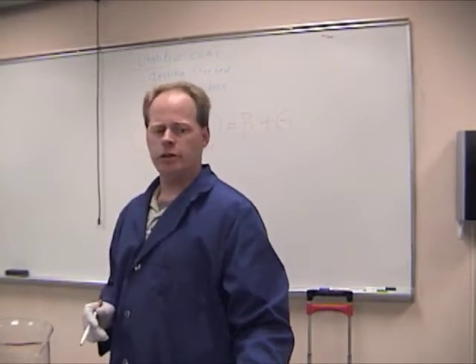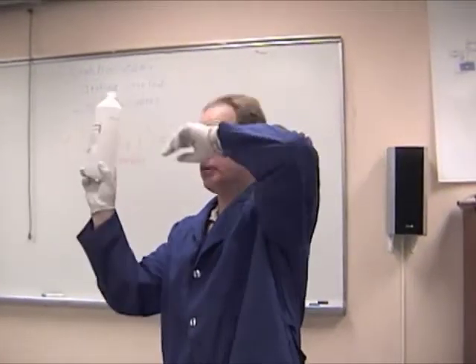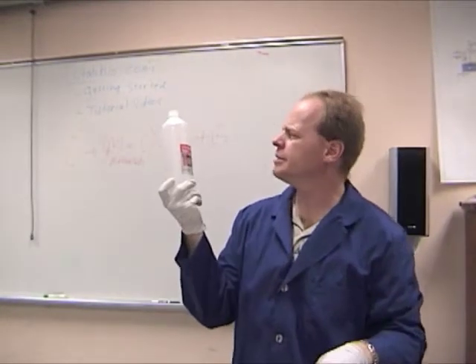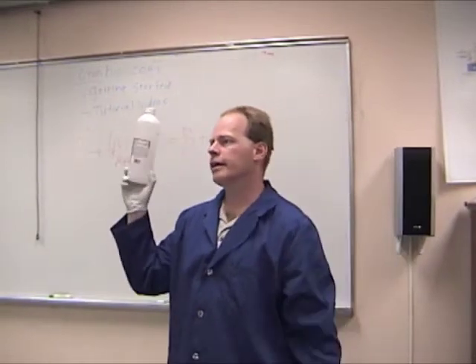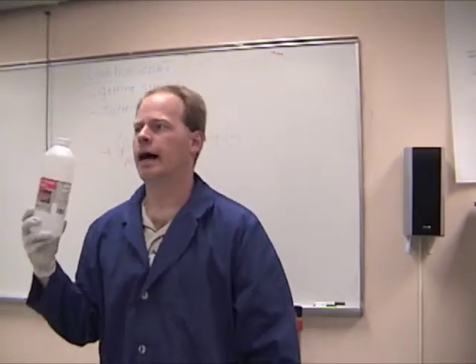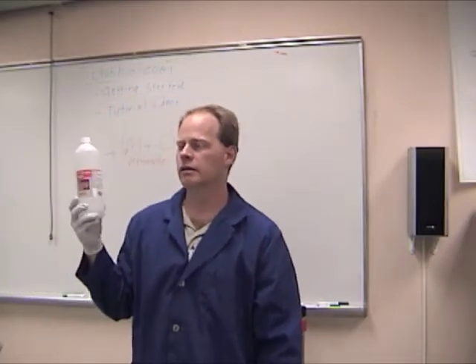The items needed to do a titration: you need some isopropyl alcohol. I recommend getting it as pure as you can. This came, I think, from Walmart. You can walk into Walmart and get it super cheap. The red bottle of HEET is isopropyl alcohol as well.